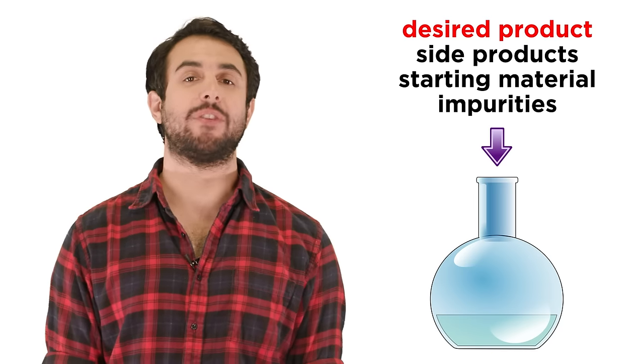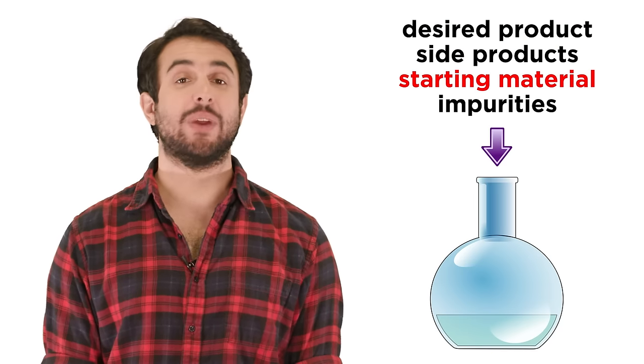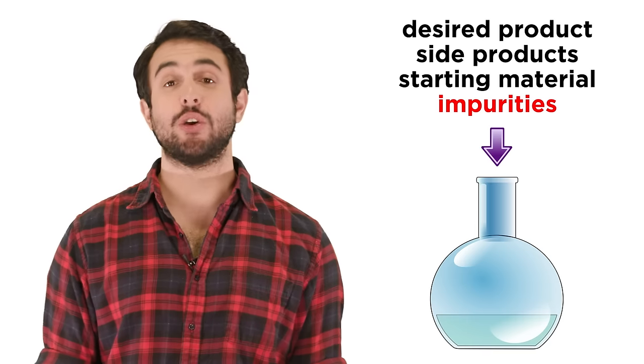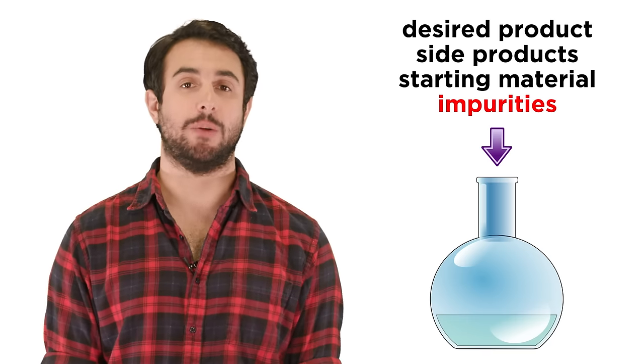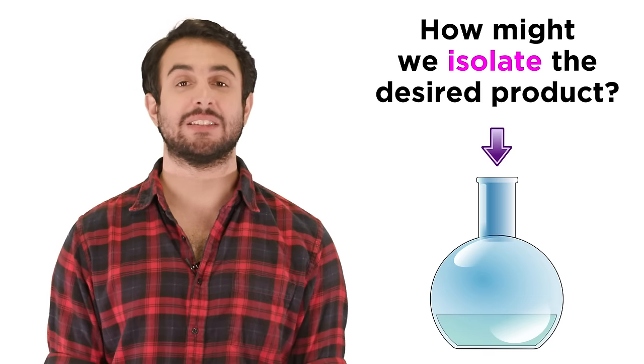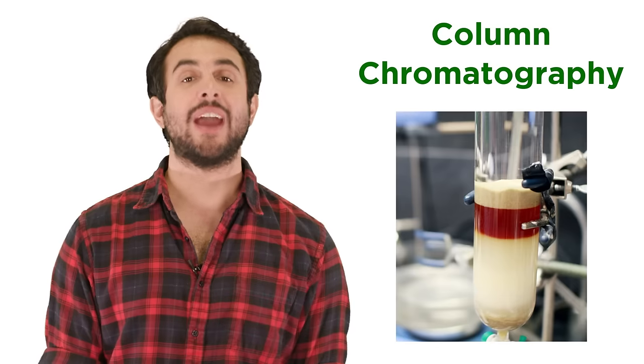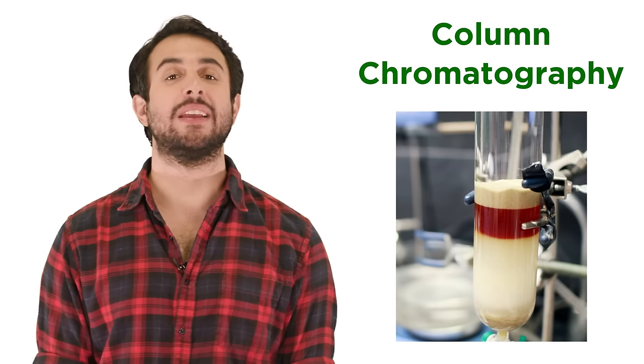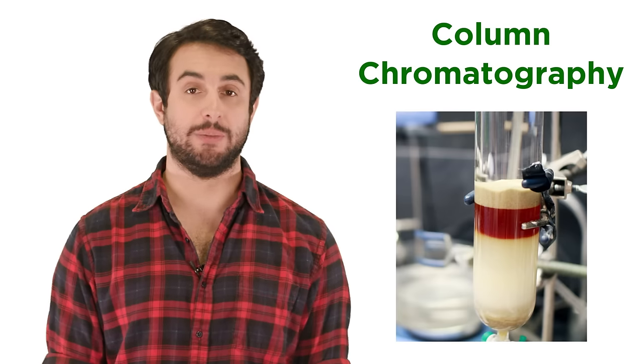When we do chemistry in the lab, it's never as neat and tidy as it is on paper. Any reaction will have unwanted side products, unreacted starting material, and other impurities in the product mixture. We need a way to separate everything so that we can isolate the desired product. And often times, that way is column chromatography.